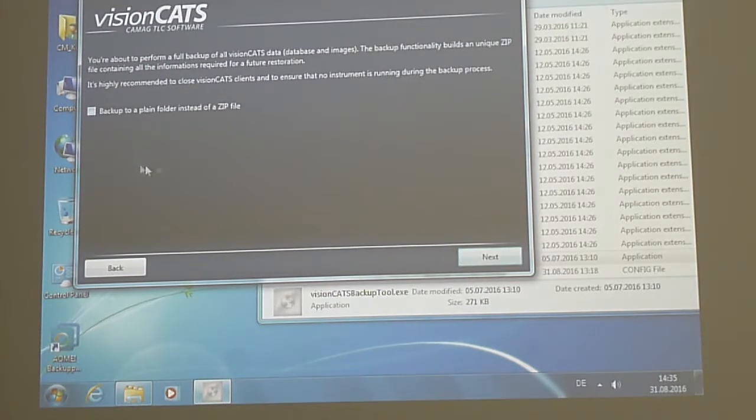If you leave it like that, you have a zip file. This zip file is made new every time. So therefore, if you keep 3, then it is getting bigger, bigger, bigger. The thing is really that we had this one customer with 19,000 analyses. The backup took about 7 hours, something like that. Backup 7 hours, and the update from 2.1 to 2.2 took about 9 hours.